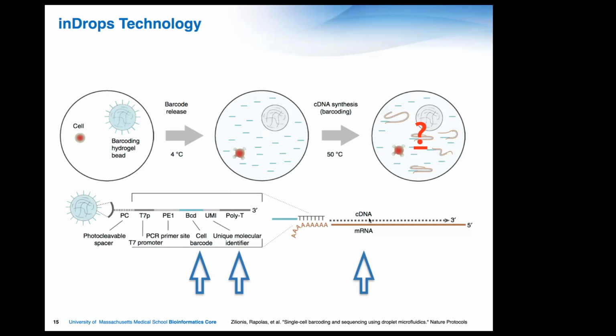The third, more obvious but just as important thing on these beads is oligo dT. And it's this dT, just like if you were doing RT for qPCR, annealing to the transcript's poly A tail and causing the reverse transcription reaction to start, because there's also reverse transcriptase in here.